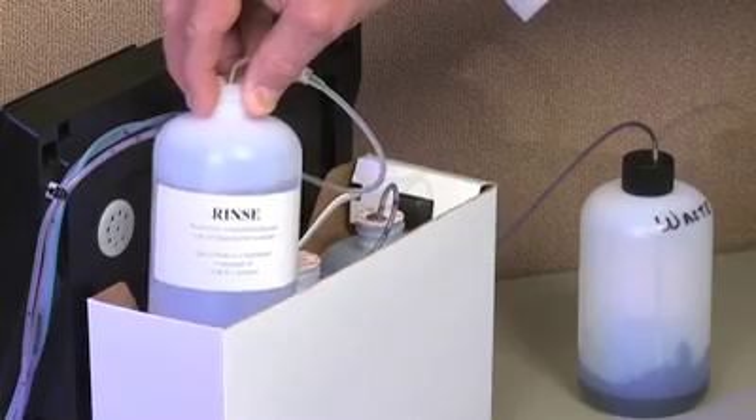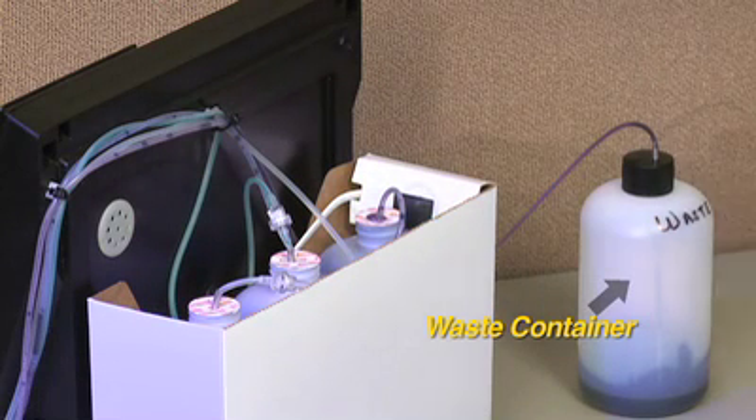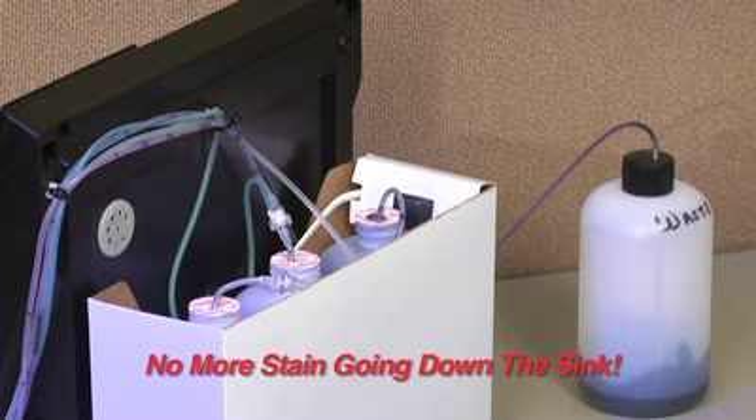For appropriate environmental disposal of reagents, the Plus pumps waste to an approved container you choose. No more stain going down the sink.